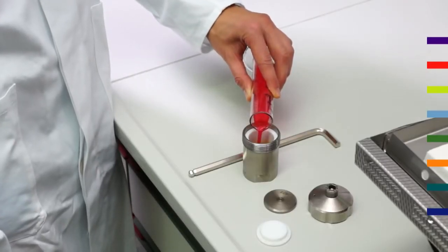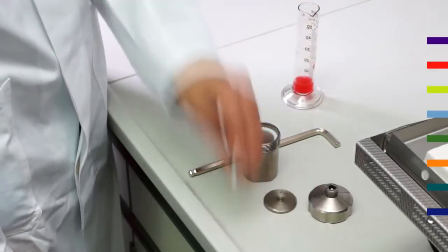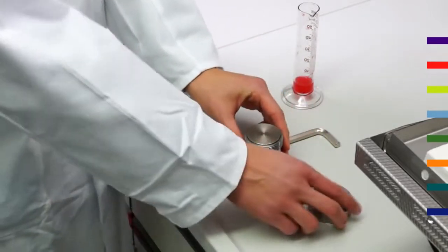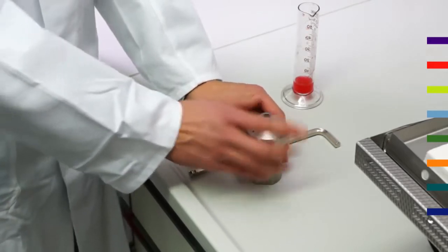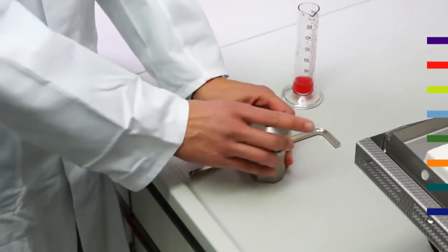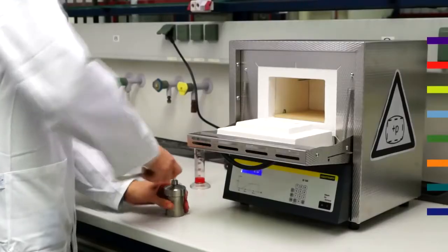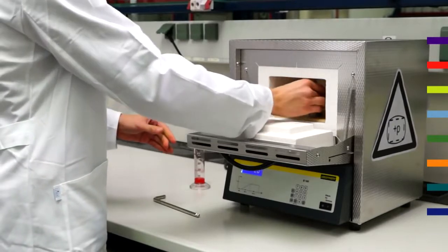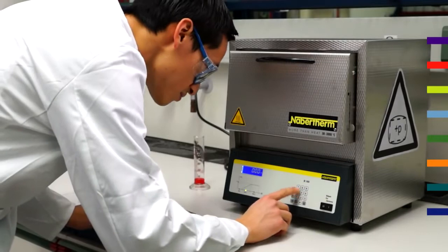Chemical reactions under high pressure may only be performed in suitable certified pressure vessels, which are called autoclaves. The maximum temperature and the maximum pressure, depending on the volume of the reaction mixture in the autoclave, need to be observed. Pressurized vessels may only be opened after pressure equalization. The experimental apparatus must be labeled accordingly.